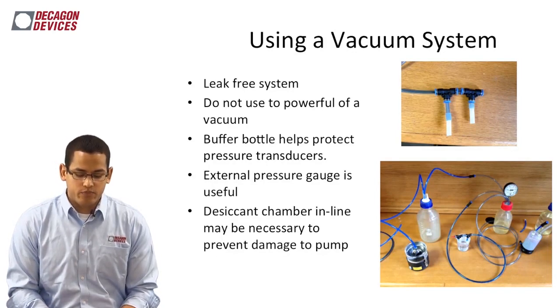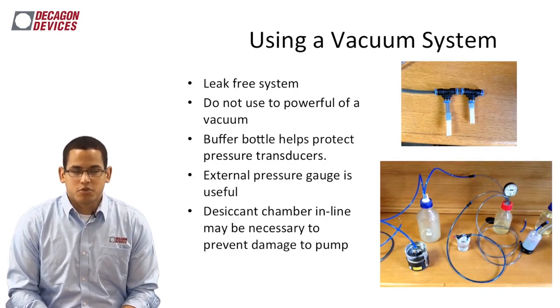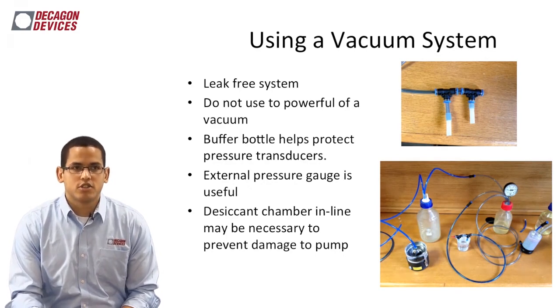When you're doing this, typically you want to put the system under vacuum for anywhere from 12 to 24 hours to get a good fill. And so this goes back to that patience thing.